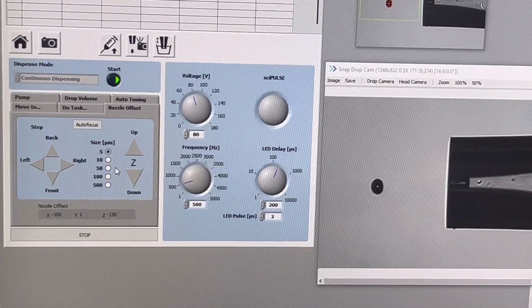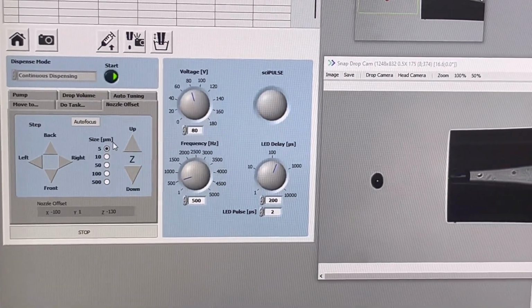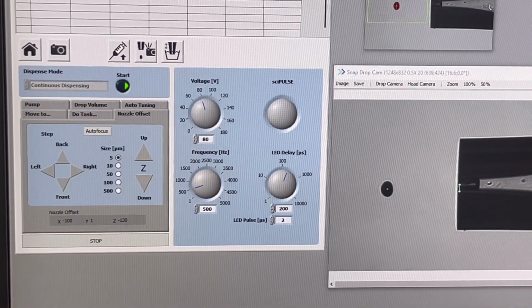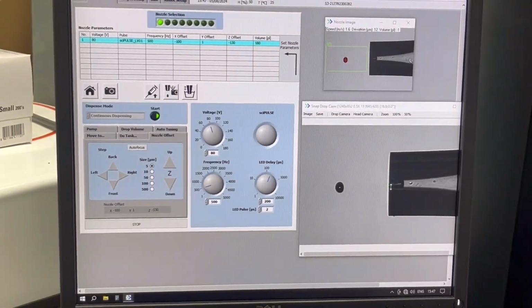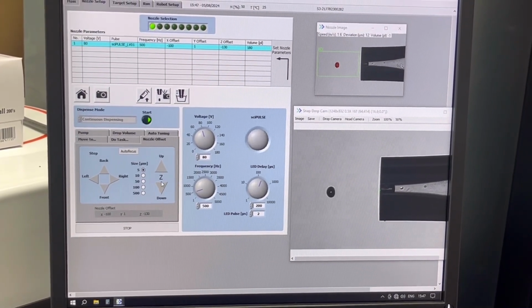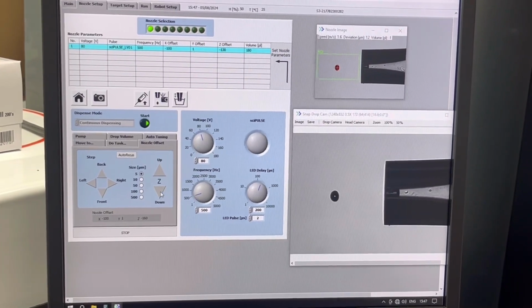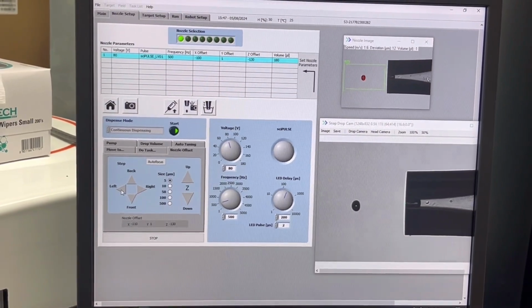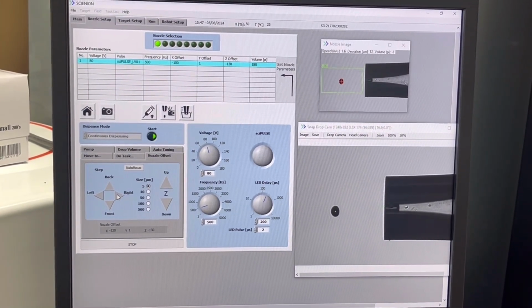If we select 5, it will step only 5 micrometers, a smaller distance, right? It depends on the position of the cross. We select whichever corresponds, like in here, and we see how it changes, right? Similar for here, if it is in here, we click the right.